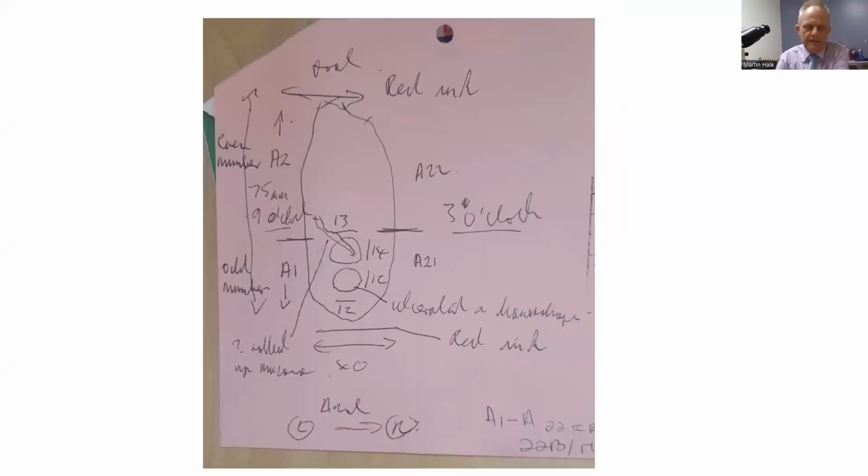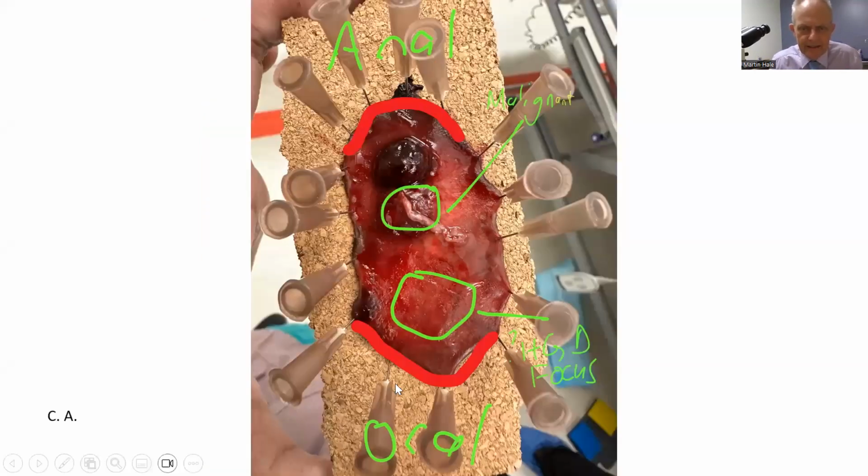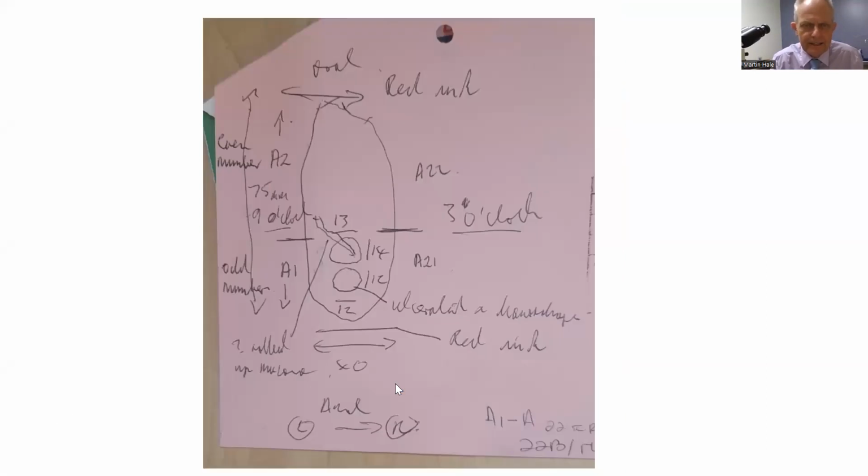So this now, and please excuse the artwork, I have inverted it. That's the anal end and that's the oral end. As I said to Vikash, we have to standardize which way we're going to put these things up, so that when we take pictures, we can make sure that there is uniformity. So this is the oral end. I hope you can read my writing. And this is the distal end here.